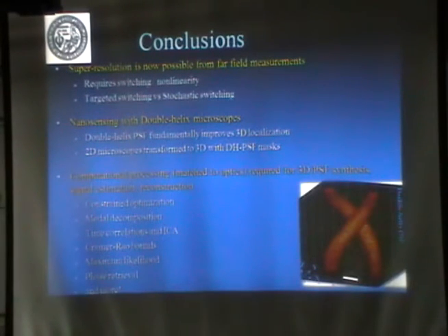Okay? So in this case, we designed the optics using some signal consideration, and then we use signal processing to reconstruct the image. So we use signal processing in the design and in the estimation later on. We use it both ways. It's not that we take an image and then we do the processing. So we need to work together with the signal processing and the optics, okay? And possibly with the detectors and the cameras, because also critical is the number of photons you can get from every point.